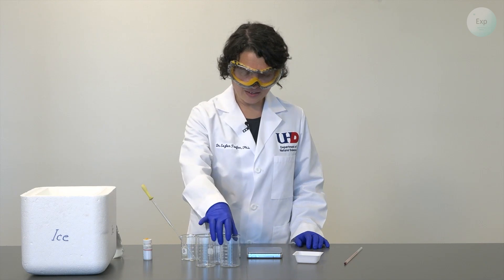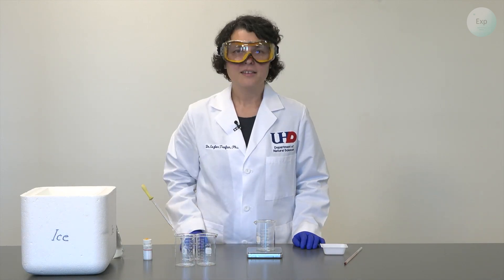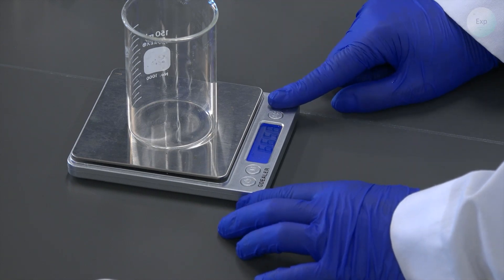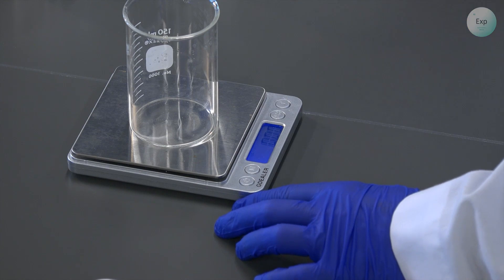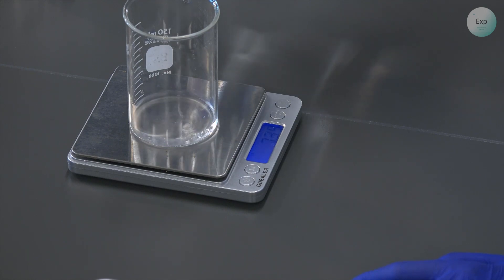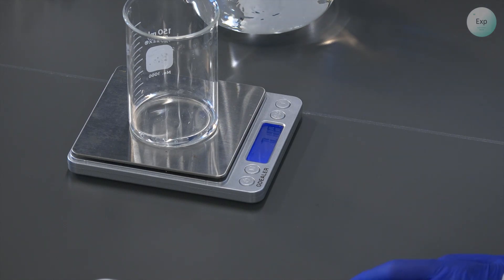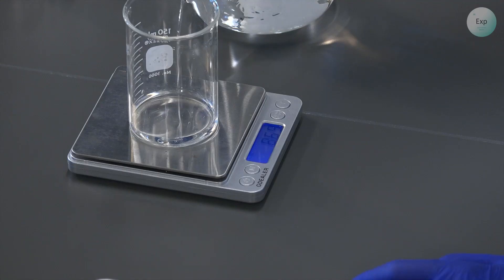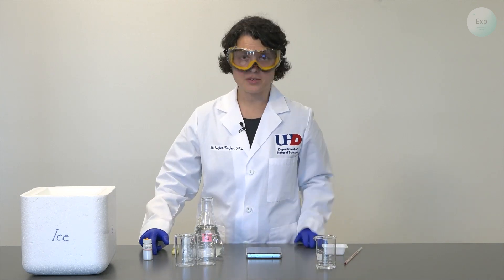Let's begin our measurements. In each of these beakers, I will add 10 grams of deionized water. For these measurements, I want to be as close to the value as I possibly can. After I place my first beaker on the scale, I will tare it, and then I will add as close as possible to 10 grams of deionized water. If I become a little bit uncertain, I can always transition to the use of a pipette. And in my first beaker, I have exactly 10.00 grams of water.